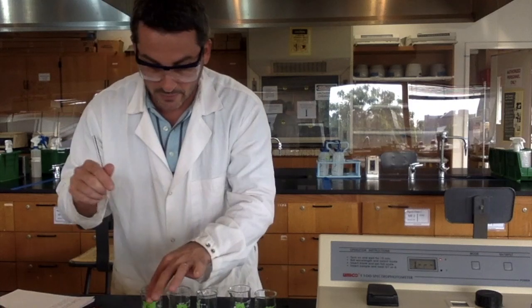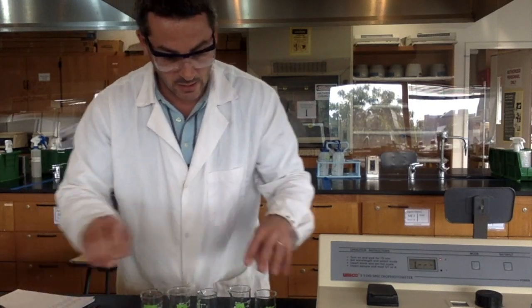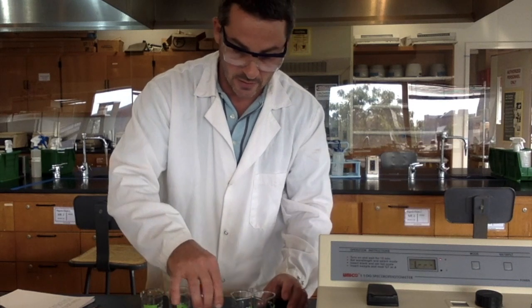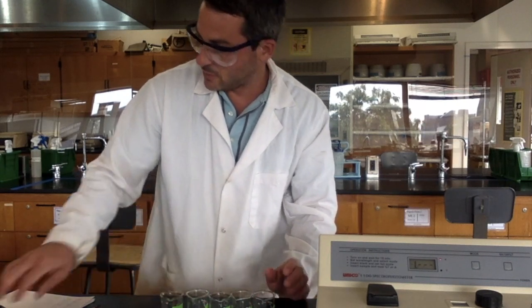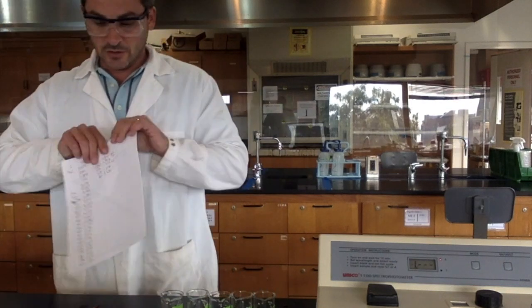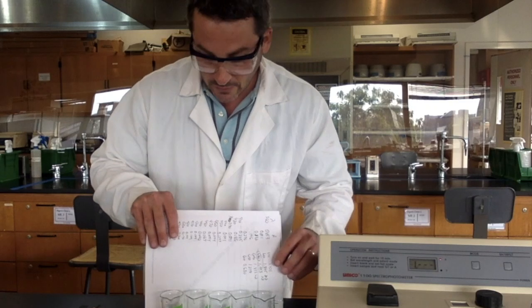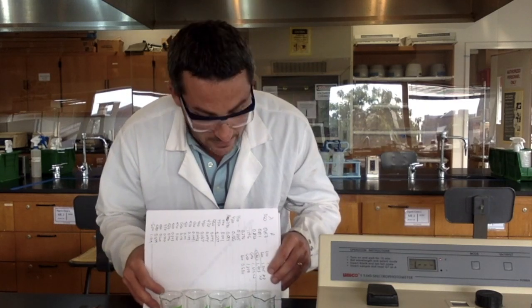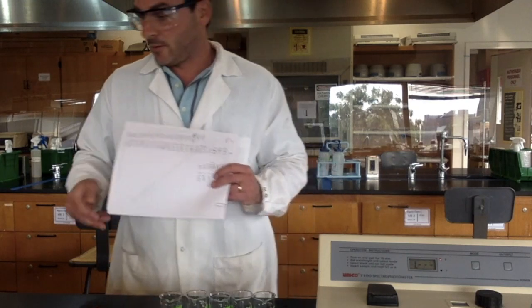So now I mix up E, and there we go. You can see here my solutions should get lighter, right, because I'm diluting them. So you can possibly kind of see that. A is the darkest, E is the lightest, it's the most dilute.